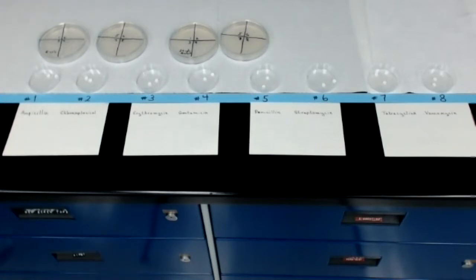In the module we're doing today, Module 16, we are going to be looking at biological antimicrobial agents, also known as antibiotics. We're going to evaluate the effectiveness of several antibiotics against E. coli and Staph aureus.